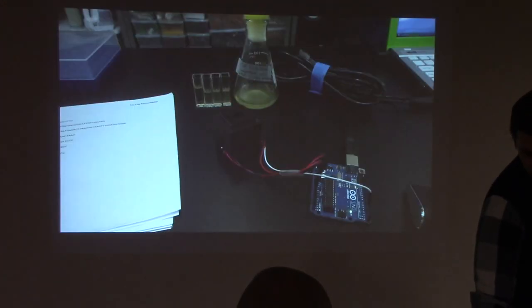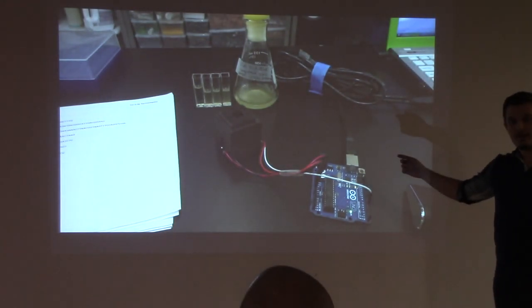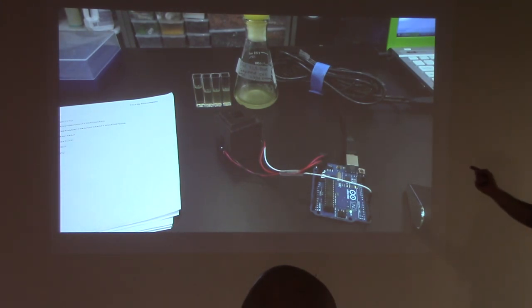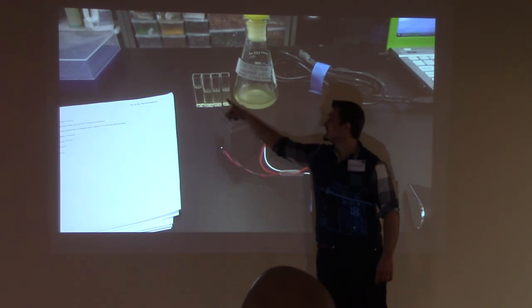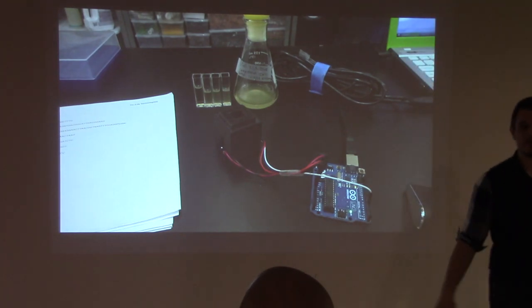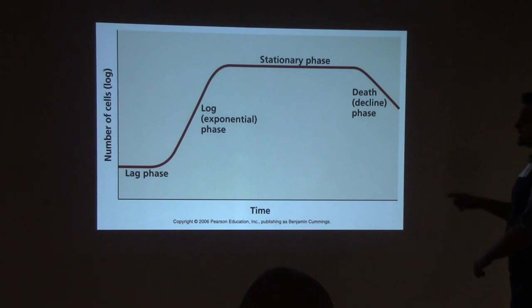And that concentration can be measured using a device I made that's like $4, and it can replace a $2,000 spectrophotometer for this specific purpose. It's 3D printed, open source, it's awesome. So basically you go from bacteria was inoculated T0, and then every hour I check it manually, and eventually it gets to a concentration that my computer outputs as 0.5.